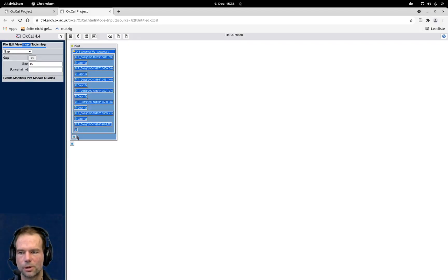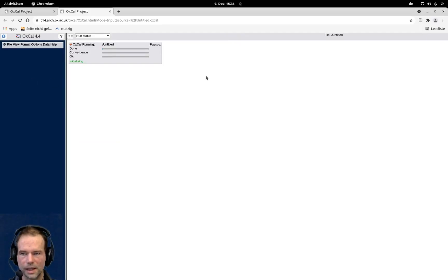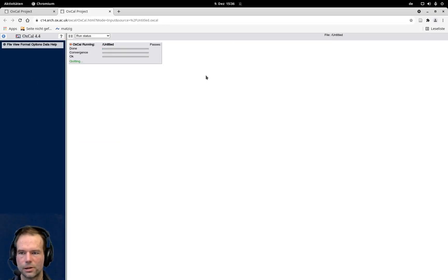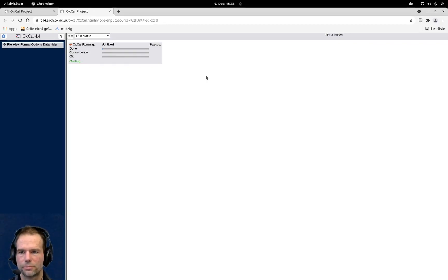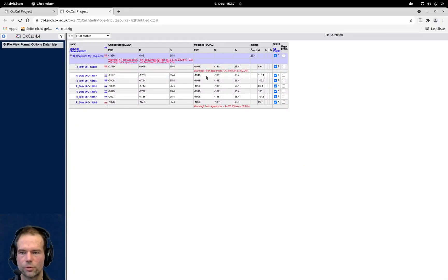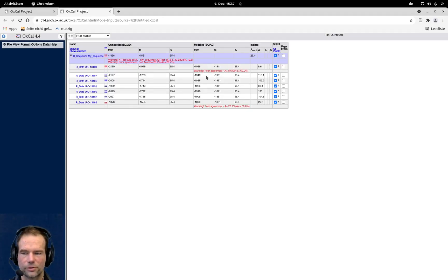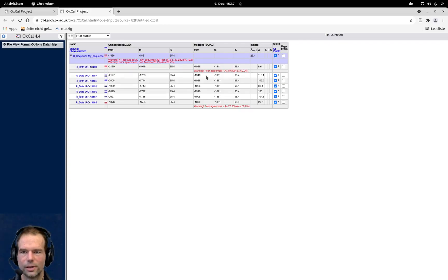Now this model looks like that. So we have all the gaps in between our C14 dates, and now I can go for run. This time, it actually runs a bit longer than if we would just do the simple calibration, because here a bit of Bayesian statistics is already involved. But it runs rather fast compared to more complicated stratigraphical models, which we come to later.